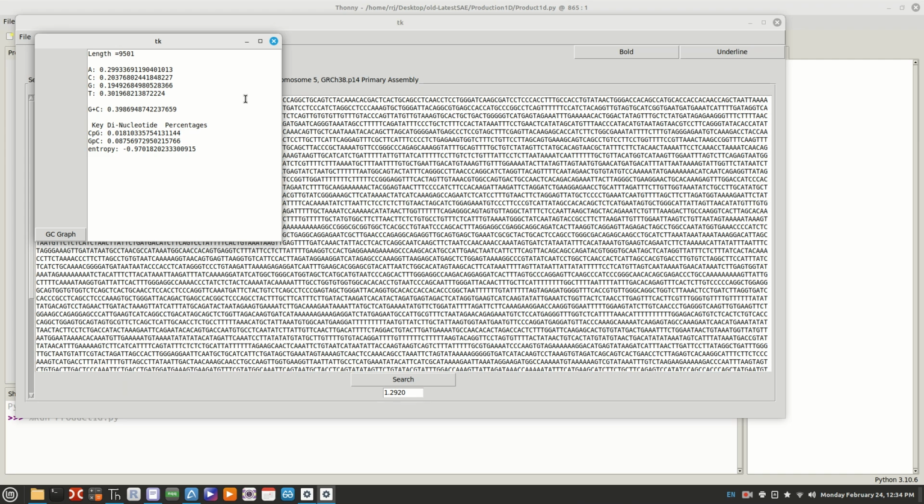So it's actually low GC. If they were ATGC equal, it would be 50%, and it's lower. And then we want the CpG content, and that is 1.8%. Realize that is rather low, and both of them are really low.